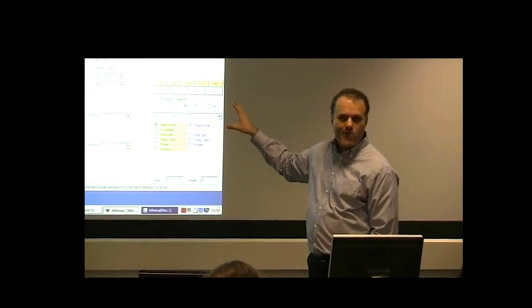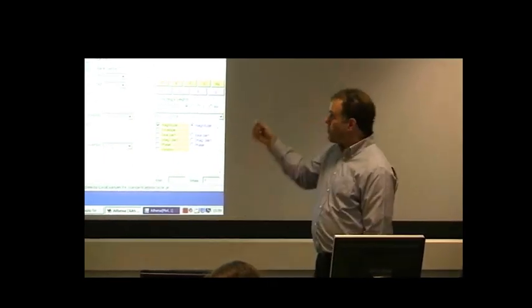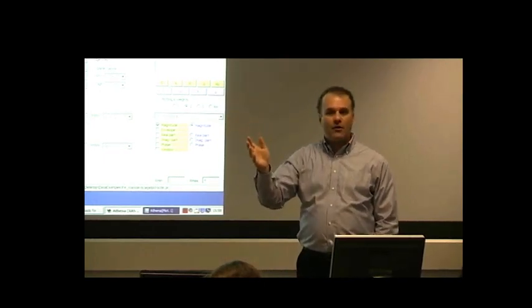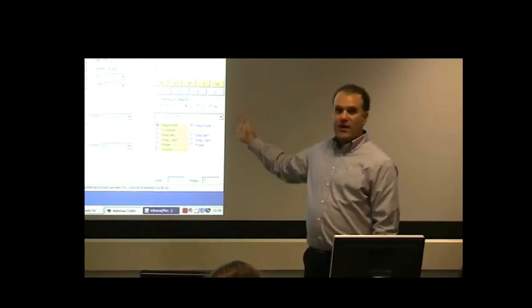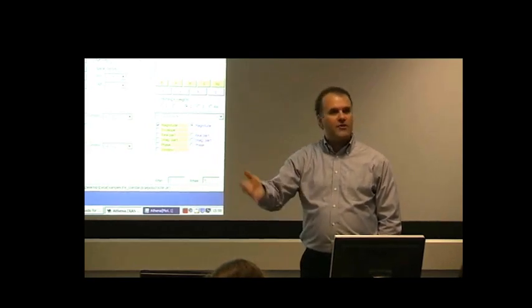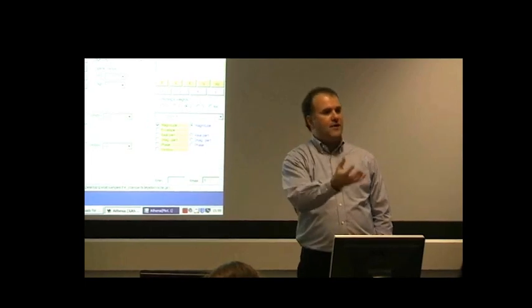It also means that you can process some data, email the project file to your collaborator who is someplace else on Earth, but also has a copy of Athena. And then when you're talking on the phone, you can both be looking at the data in the exact same state. So the project file preserves the state of your work. And that's really valuable.